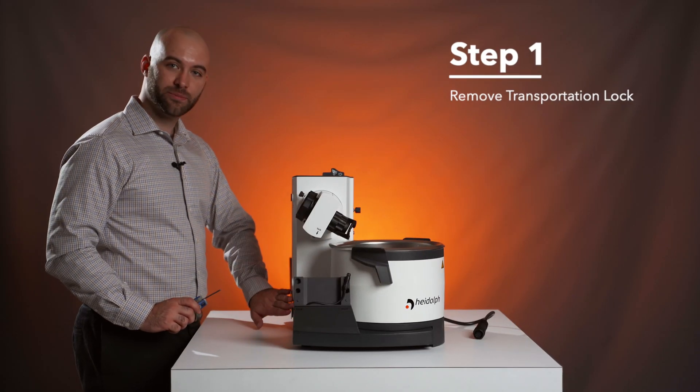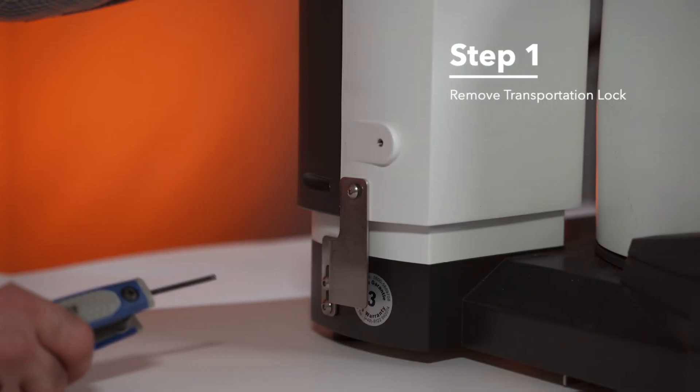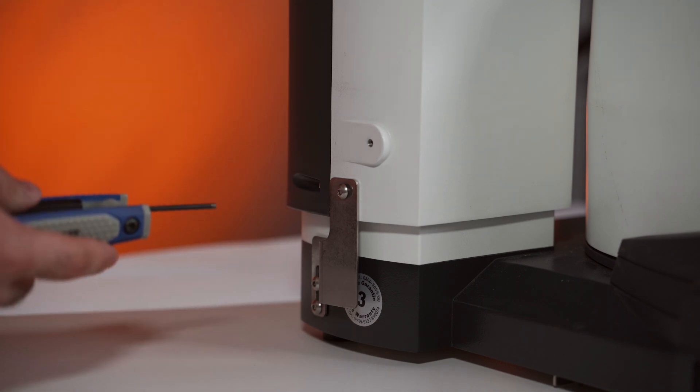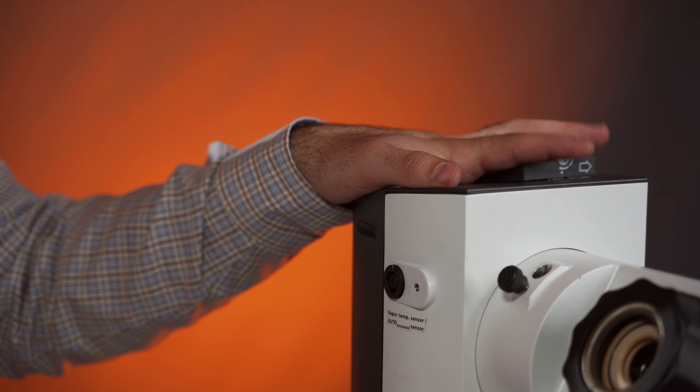Step one, we're going to remove the transportation lock with the size 3 metric Allen. Once the transportation lock is removed, the drive is going to lift up. So to make it easier on myself, I'm going to put one hand on top of the drive while I remove the first screw.